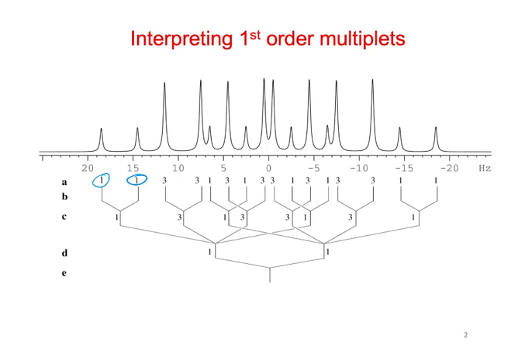Okay, so that means right there that we have a component of a doublet within our splitting pattern. So we should be able to see that distance, that coupling, this 1-to-1, in other places throughout the signal. So that splitting should match this one, this to here, should match here to here. It would match from here to here.